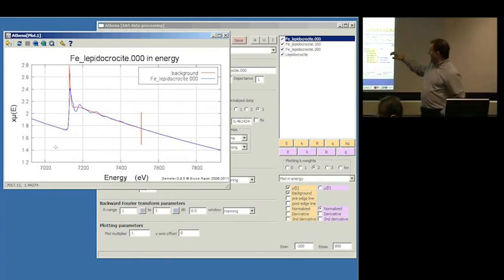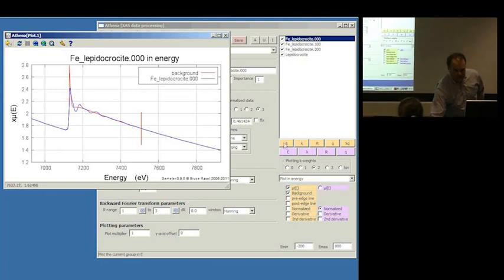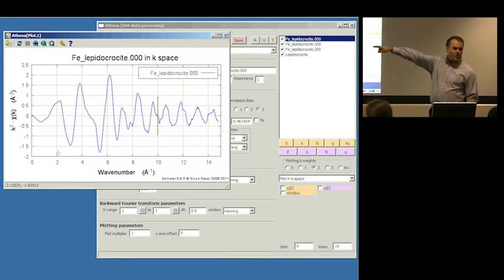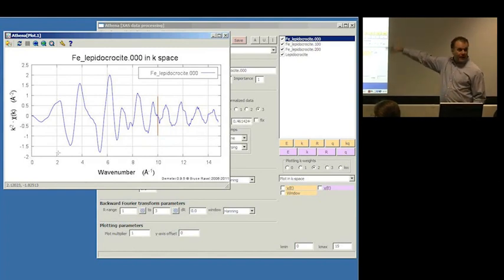And that's the transform that goes onto the y-axis. So those two things together, that coordinate transform and the subtract the red line and normalize transform of the data, possibly with K-weighting, is what makes the y-axis. So that's from energy to K.